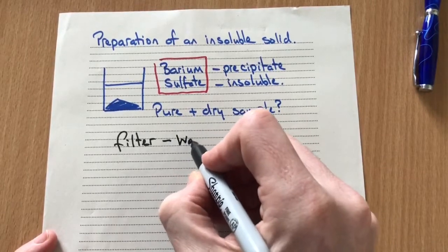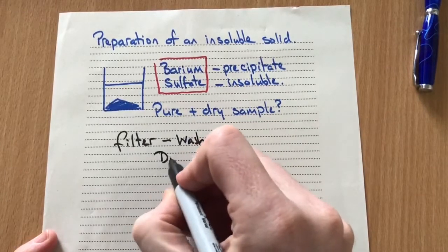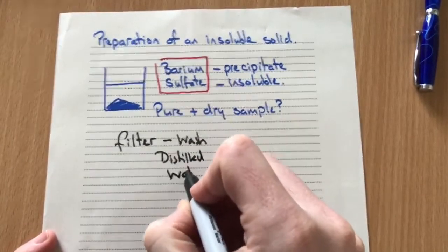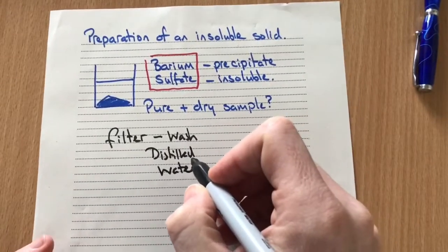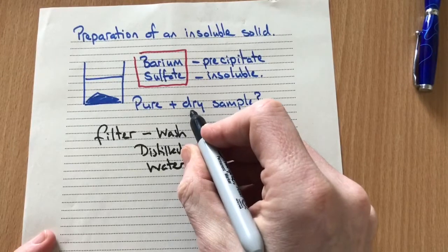What we then need to do, in order to make that pure, is wash it. So you would wash that down, and we would normally use distilled water, and that just helps to make sure that we don't add any impurities. Once we've washed it, we then need to make sure we've got something that's going to be dry.